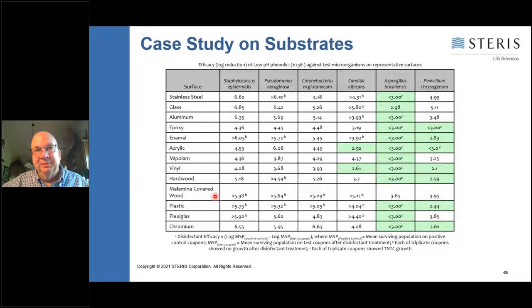A couple of interesting ones here were hardwood and melamine covered wood. Just as a reference, in clean room settings, you should never have wood in the clean room. It's a very porous material, and it's nearly impossible to get microbial kill with it, because organisms hide in different layers of that porous material.